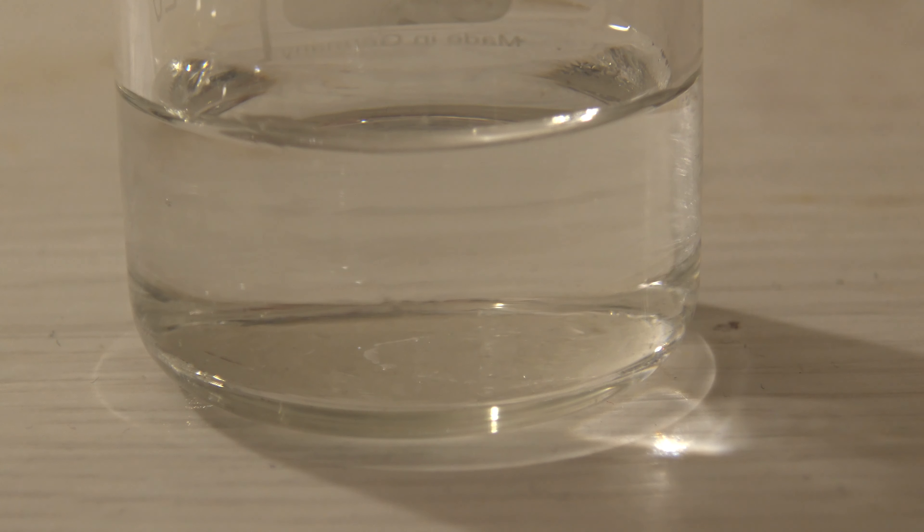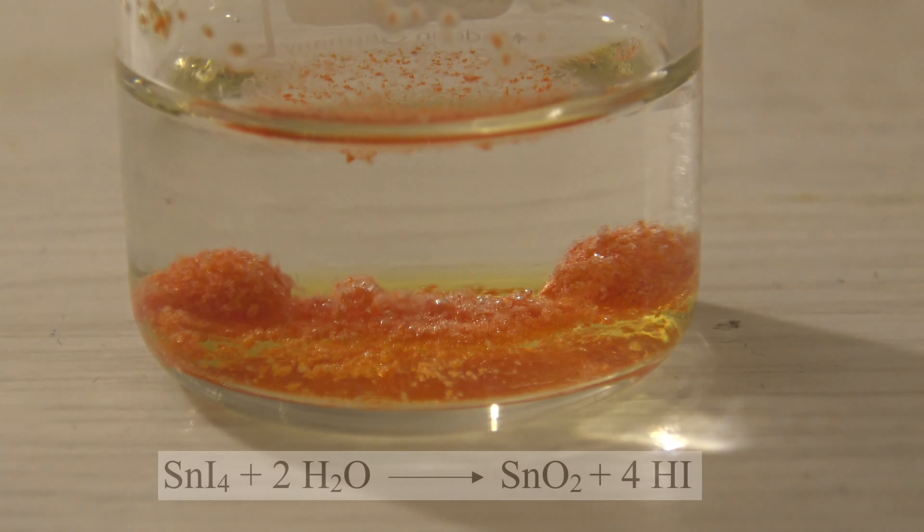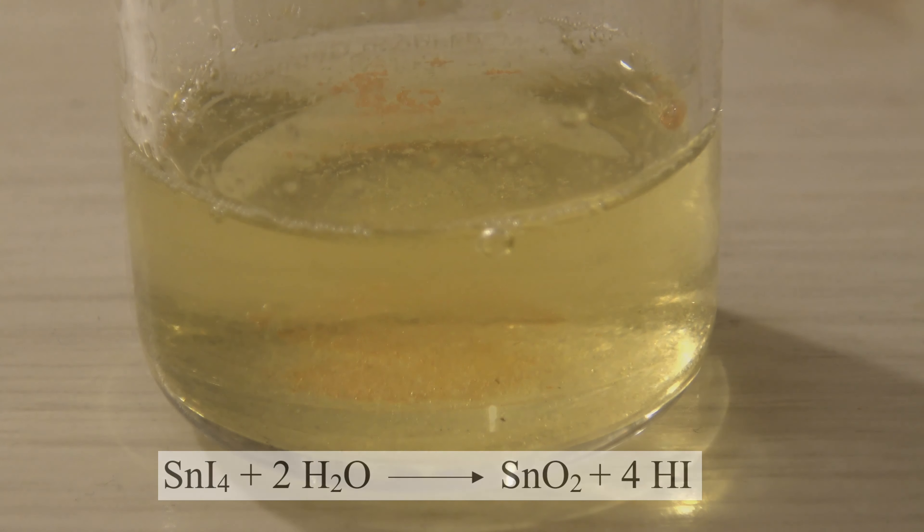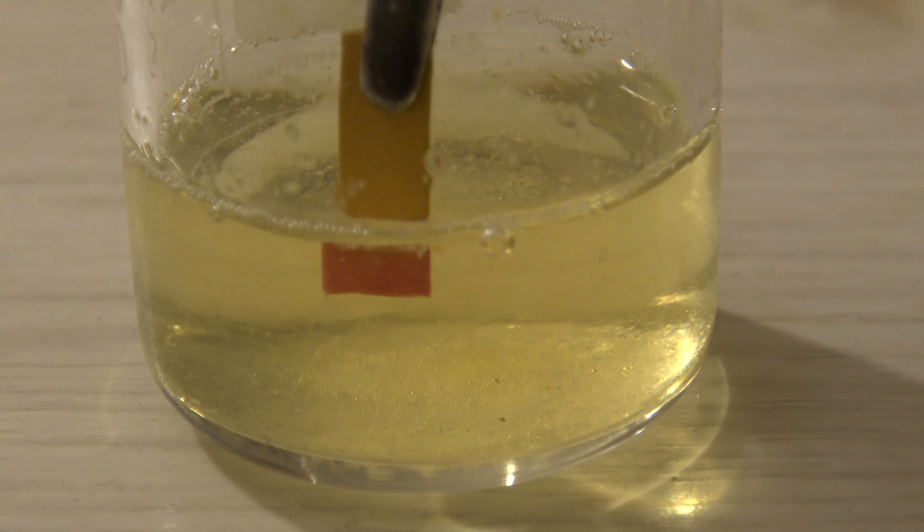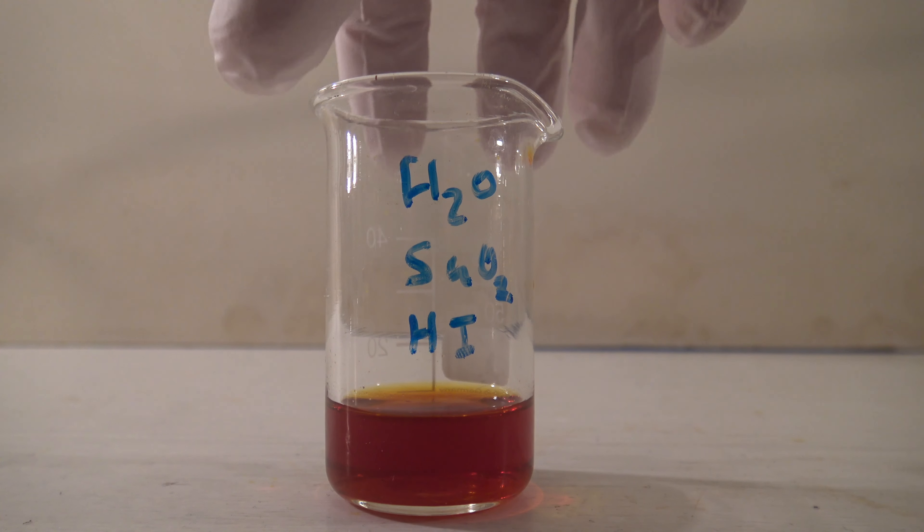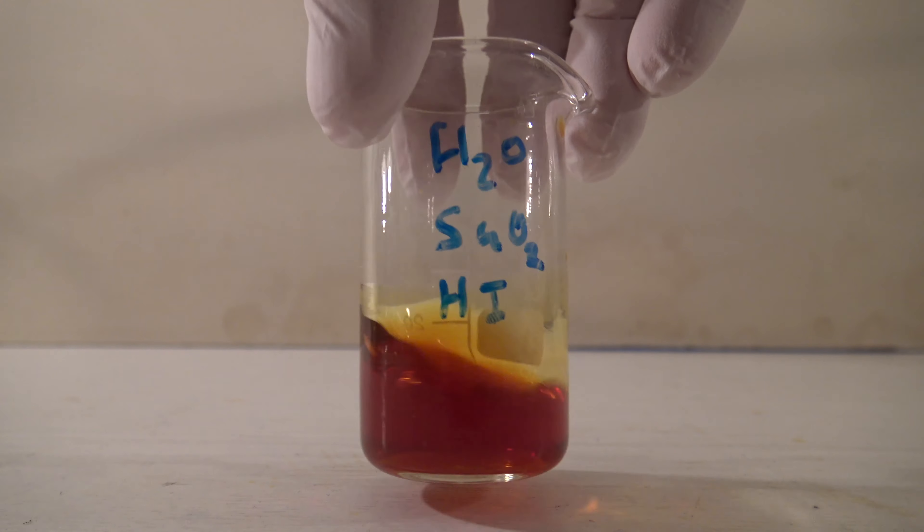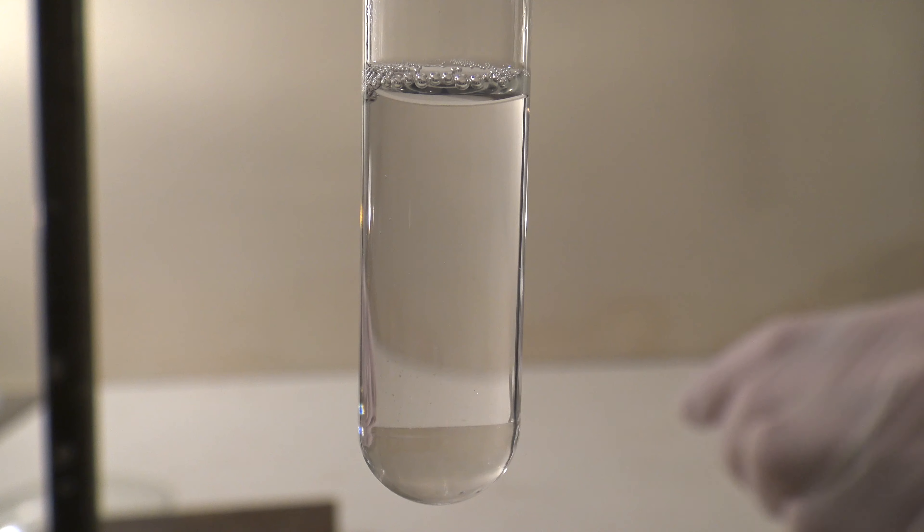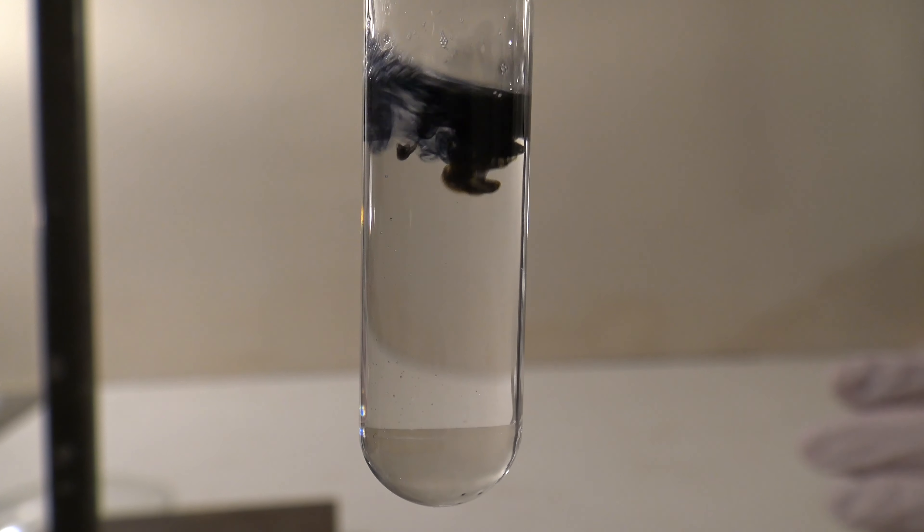When tin(IV) iodide comes in contact with water, a slow hydrolysis takes place and insoluble tin(IV) oxide and hydrogen iodide are formed. The hydrogen iodide causes the solution to become strongly acidic. It can be oxidized by the oxygen from the air, which causes iodine to form slowly and leads to the color of the solution. To test for iodine, a solution of starch can be used. The typical complex of iodine and starch is formed.